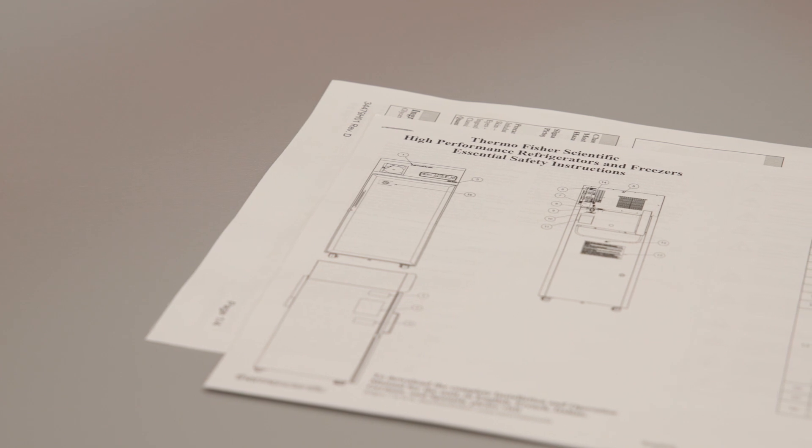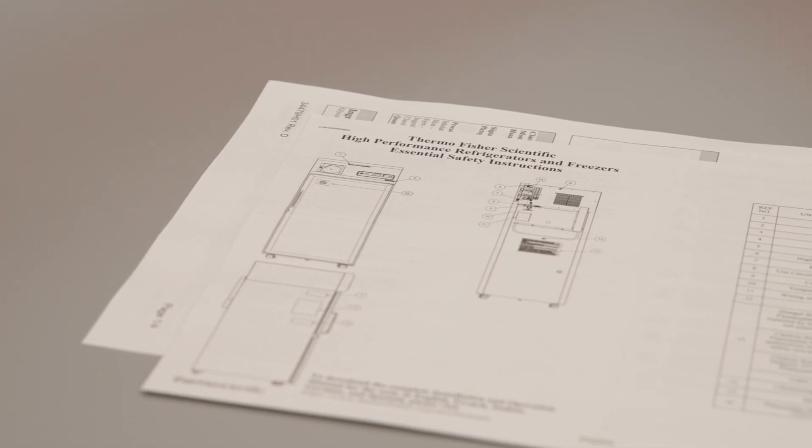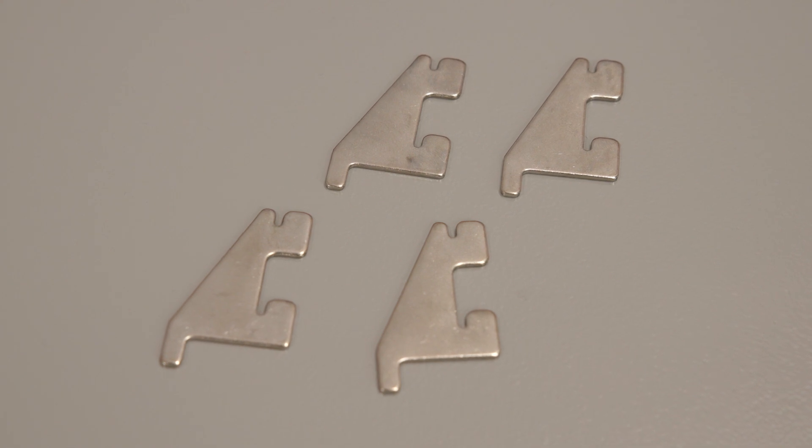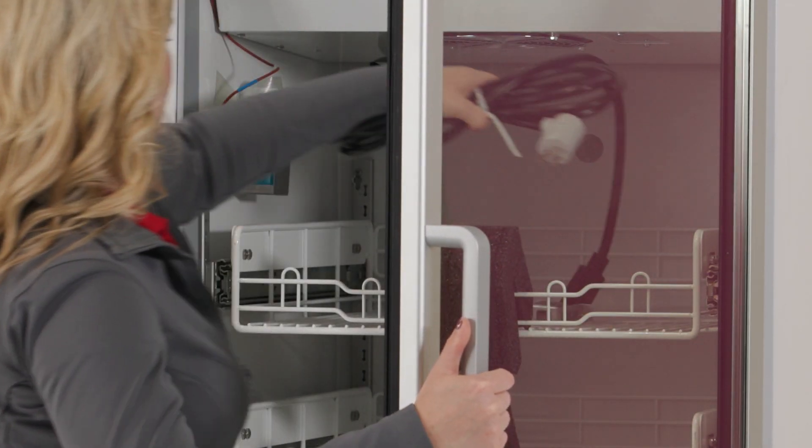Verify that the components are all present: installation and operation manual, door lock key, shelving clips, shelves, and power cord.